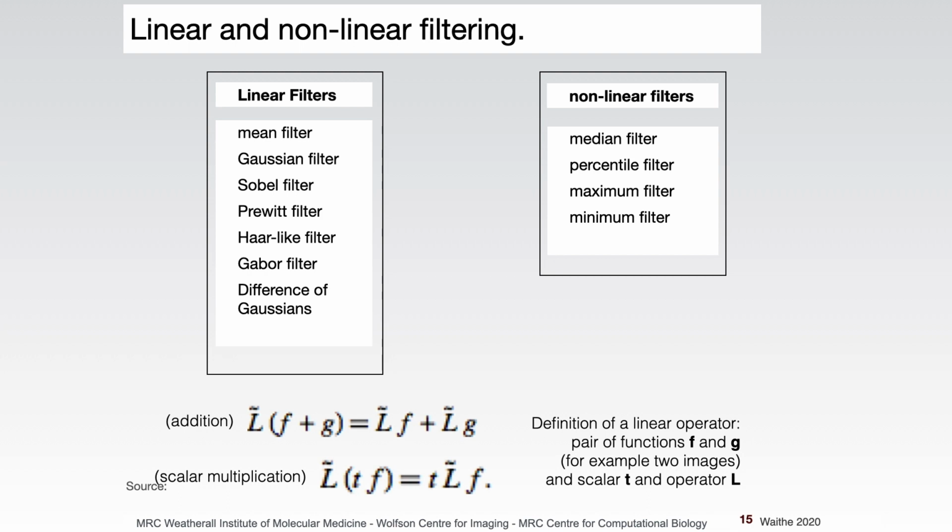So you don't throw away any data. It's just taking what's there, applying a transform to it, but you don't lose any information. You can go back reversibly. Whereas with a nonlinear filter, the methodology in each position could be slightly different, and so there's no way of knowing exactly how to go backwards unless you explicitly record what you did.